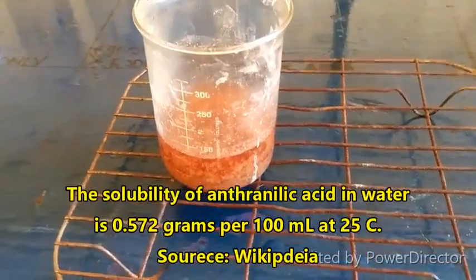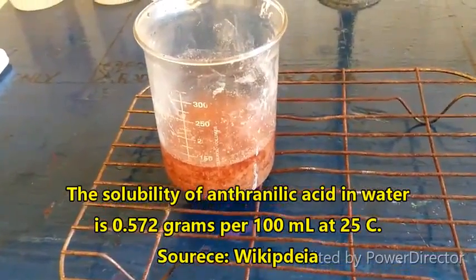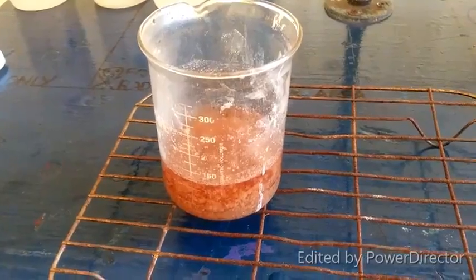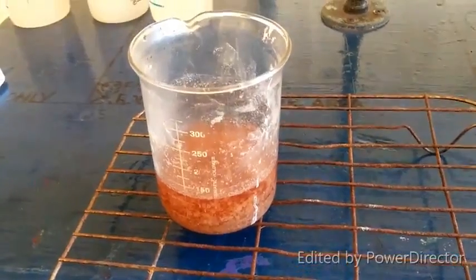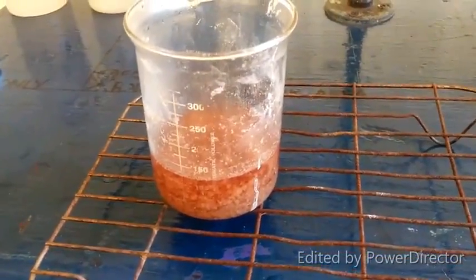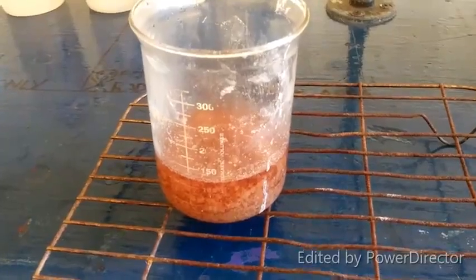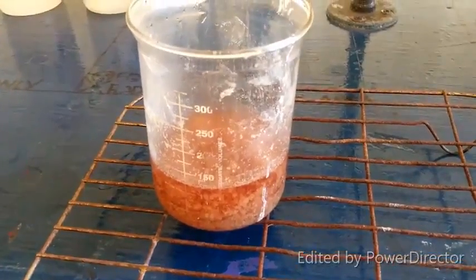So I think that's a good amount to do a recrystallization with, probably about 125, 150 mils at the most, for this particular synthesis and the crappy yield I got. But anyway, at least I got it to work this time, and that's what's important. So here it is recrystallizing, and once I've filtered it out and dried it, I will come back and show you guys what it looks like, and then we will wrap up the video.